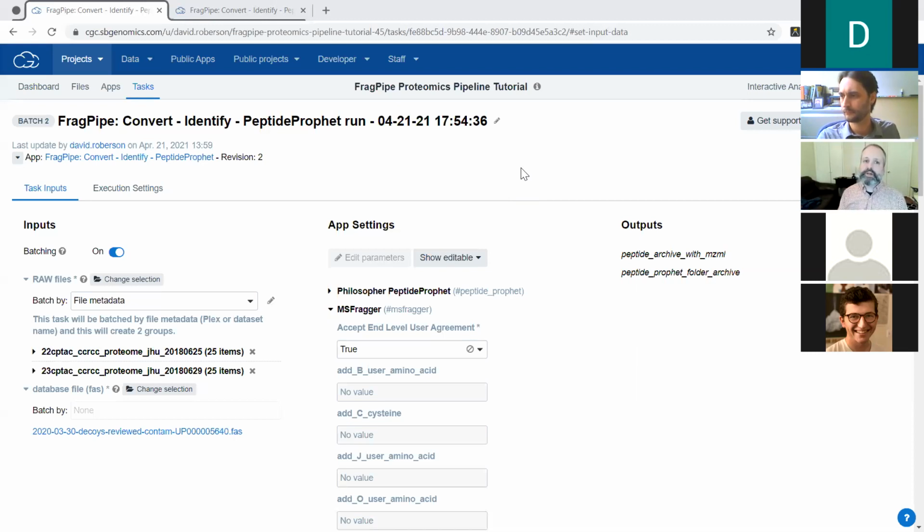It doesn't cost much money, but it does use multiple instances to get that speed. Each billing group has a limit on the number of nodes you can use at any given time. That said, the system will automatically queue up the jobs. I just don't want to get any queuing during the workshop.